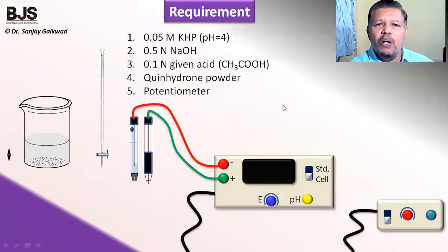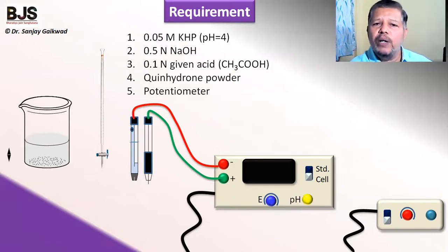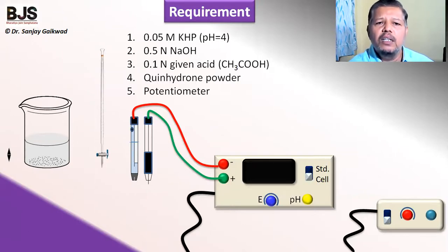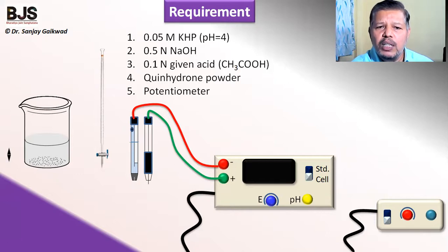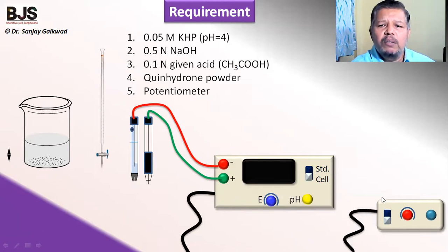For this experiment, we require the following solutions: 0.05 molar potassium hydrogen phthalate solution, 0.5 normal NaOH solution, 0.1 normal monobasic acid (acetic acid in this case), quinhydrone powder, and a potentiometer. The potentiometer contains two electrodes — a platinum electrode and a calomel electrode. A magnetic stirrer is also required to stir the quinhydrone powder into the beaker.